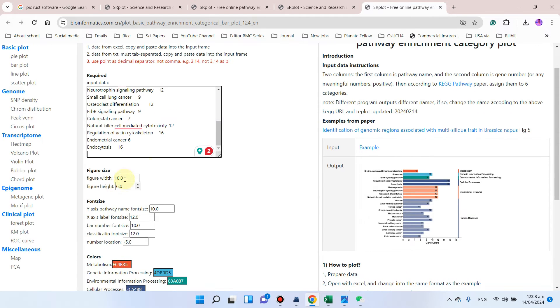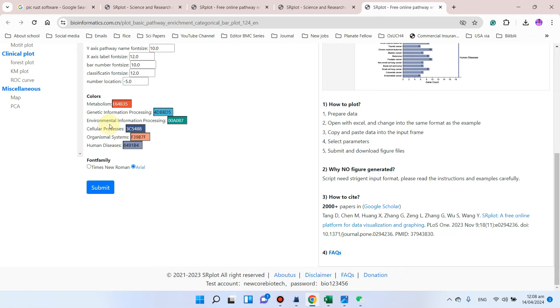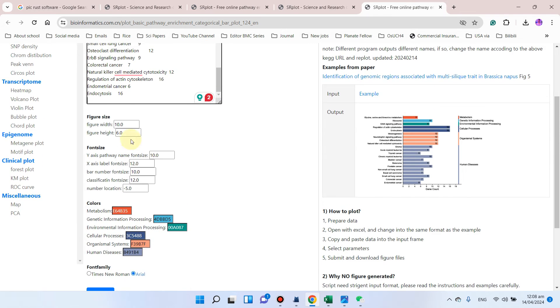As we know, the overall KEGG pathways are divided into six major categories: metabolism, genetic information processing, environmental information processing, cellular processes, organismal systems, and human diseases.